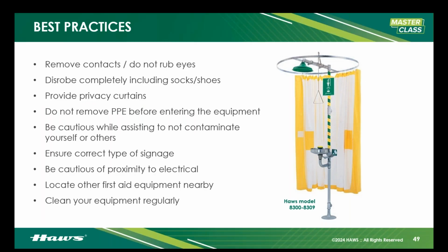But remove your contacts. Don't rub your eyes. Right, this should be a no-brainer, but contacts can trap contaminants, and the second the eye wash hits your eye, it can push that contact with the contaminants trapped to the back of your eyeball. So get those contacts out. Disrobe completely. You've got to be in your birthday suit. Remove your socks and shoes. Okay, it's not a time to be shy in front of your coworkers. We want to get these chemicals off of you and keep you safe.